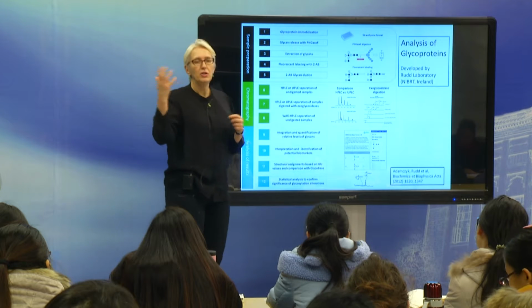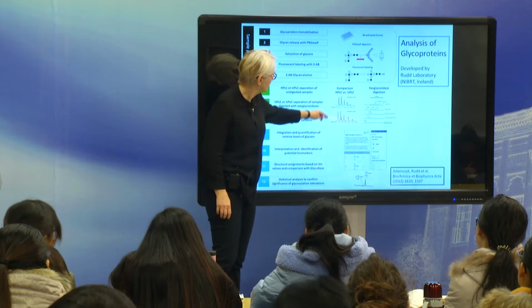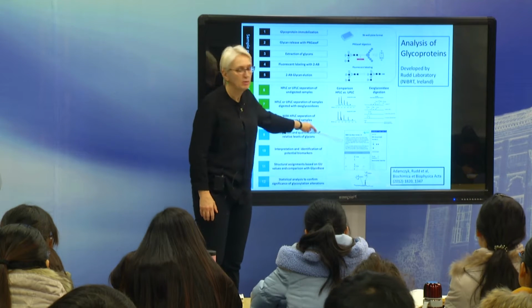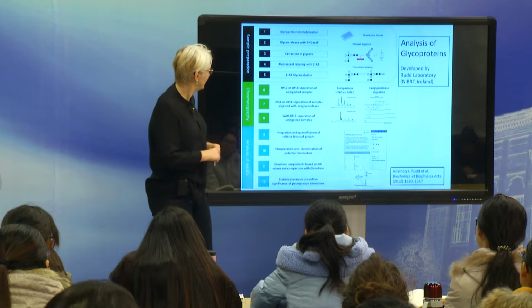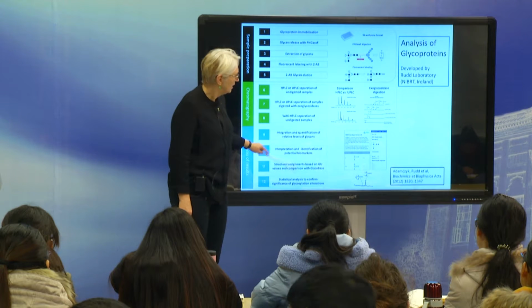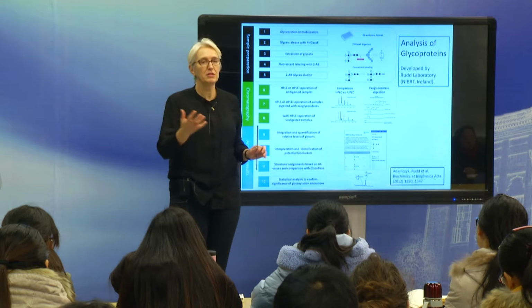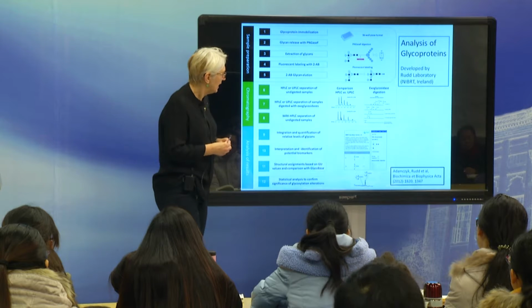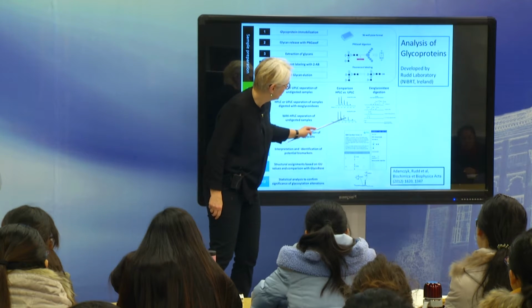And this whole knowledge of the biosynthesis, the mass spectrometry, the glycosidase digestion, these patterns, you put into databases. You can imagine this is an enormous amount of information. So they've generated databases, they quantified all of these. These are all accessible now to people, and also are starting to become accessible to more general glycoscientists as well. And that allows you now to just assign the structures of each of these peaks.